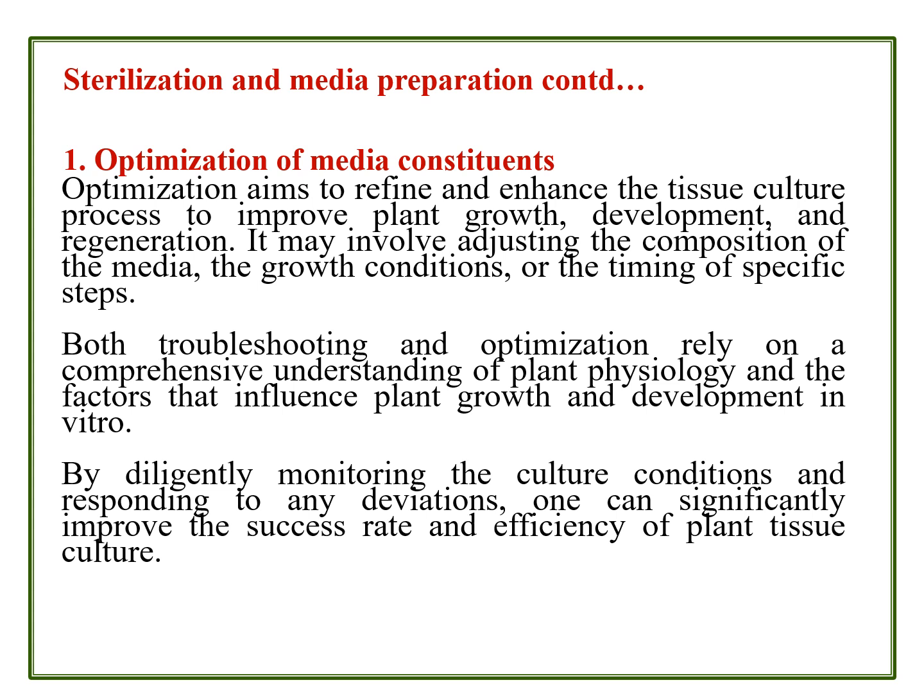So by carefully monitoring the culture conditions and responding to any deviations, one can significantly improve the success rate and efficiency of plant tissue culture.